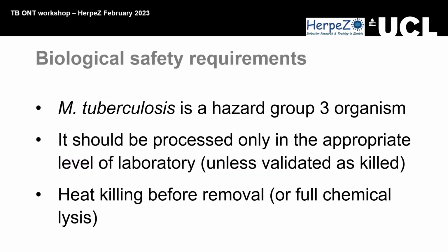And the safety requirements: TB is a hazard group 3 organism, so it should be processed in an appropriate laboratory unless it's been validated. In our case, we did the heat killing at Mr. Solo's lab, the TB lab. From there, we just did the chemical lysing and sonication.